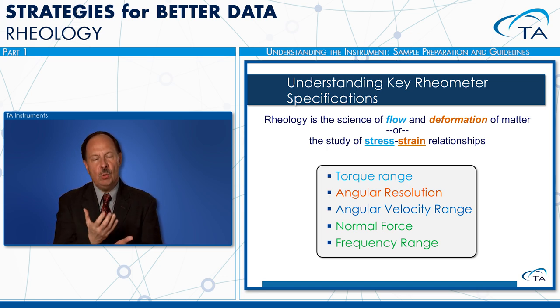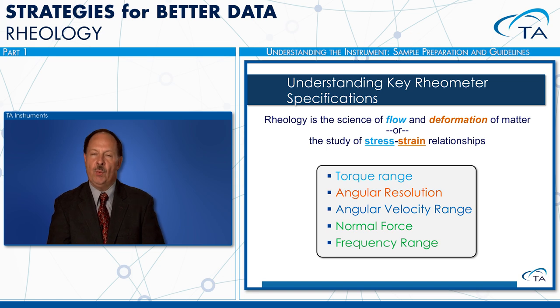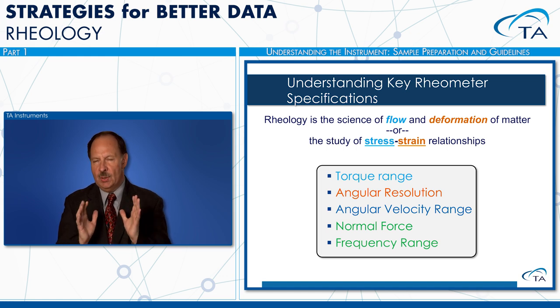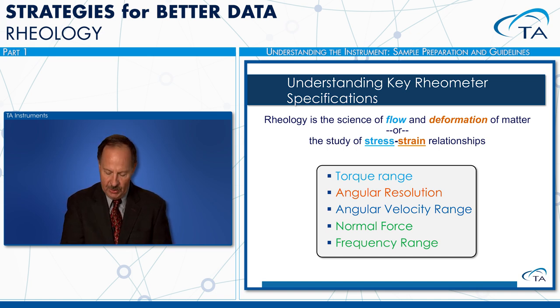A lot of times, normal force is also useful for characterizing materials such as polymer melts. Another thing is, what is the frequency range for your material? Now, we can give you these ranges for the different rheometers. A lot of times, it will depend on the customer sample to determine what range is really necessary, and also what geometry would be the most useful to work with to get the data that you're really interested in.